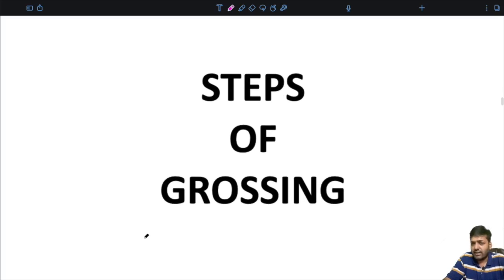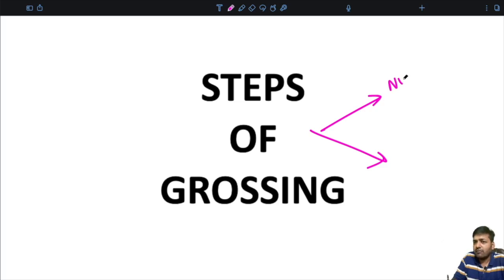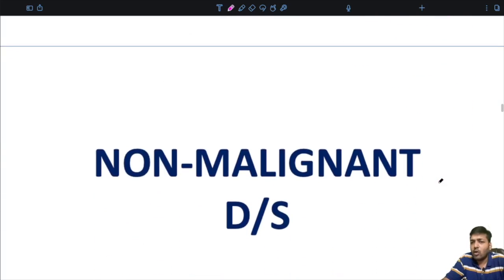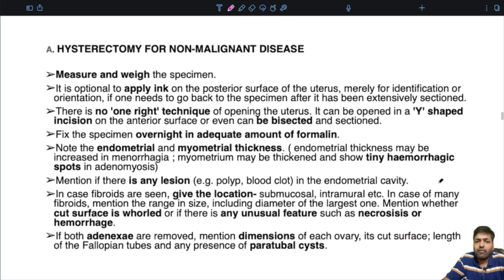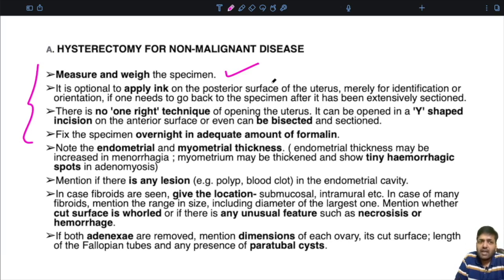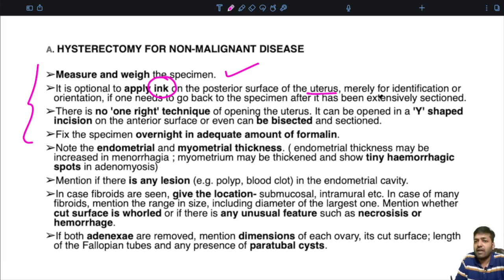Now we will look at the steps of grossing in relation to the uterus. The steps can be divided under two headings: one for non-malignant disease, for example fibroid uterus, and one for malignant conditions, for example carcinoma endometrium. The first four to five steps are more or less the same. You have to first measure and weigh the specimen. It is optional to apply ink on the posterior surface of the uterus for identification or orientation, in case one needs to go back to the specimen after it has been extensively sectioned.